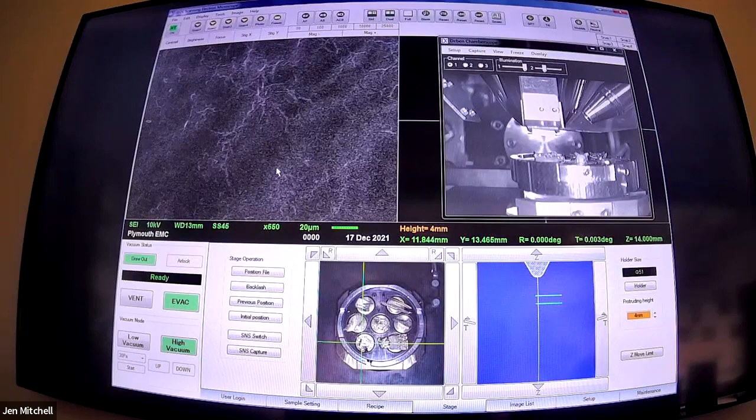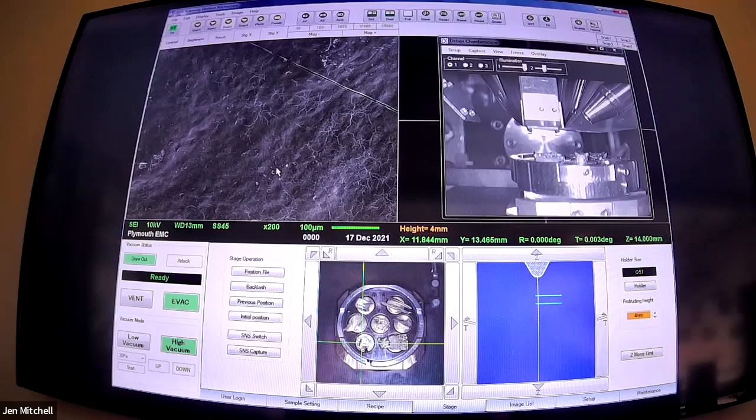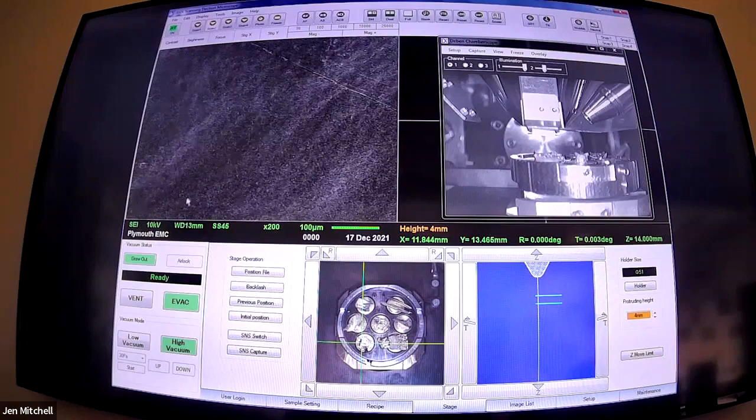This SEM has a function where you can focus either coarsely or fine. It means you can make big focus changes to get roughly in the right ballpark, and then narrow down and do the little final tweaks, which is really useful. It means you're not spinning dials for 10 minutes trying to get stuff in the right place. There's contrast between the top and bottom here.